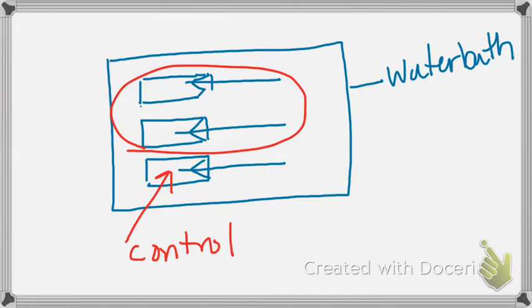People with first hour, you might want to see if you can come in a couple of minutes early to start getting this set up, because you do want the respirometers sunk in that water bath for as long as possible. I would say we want them in there for at least 15, maybe 20 minutes in order to really see any kind of a difference.